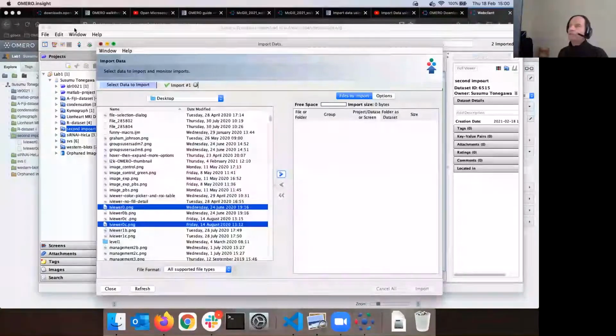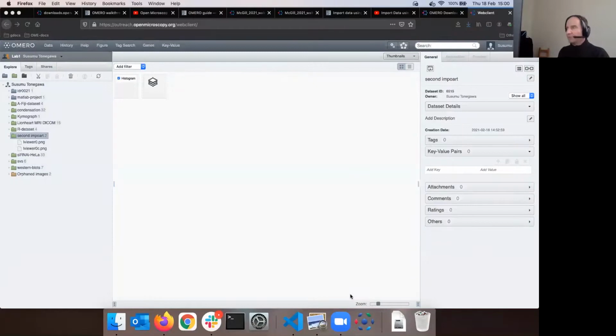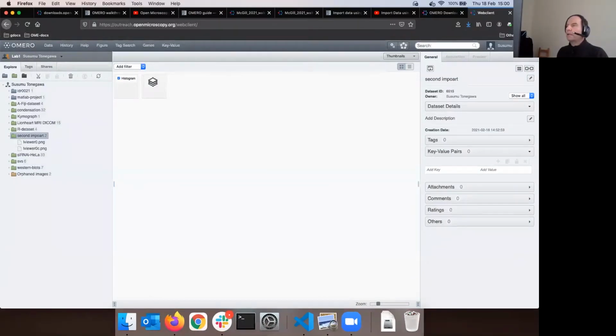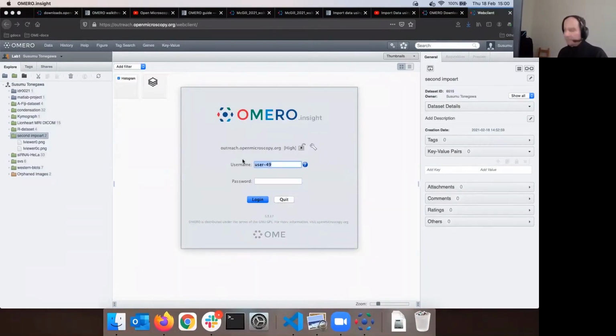But if I am in position of power, such as if I log out and log in as trainer 1, okay.